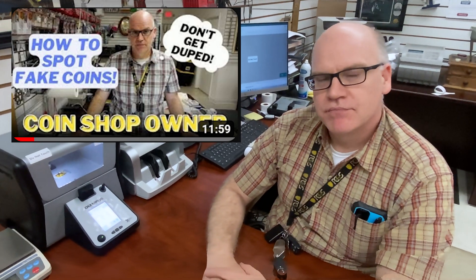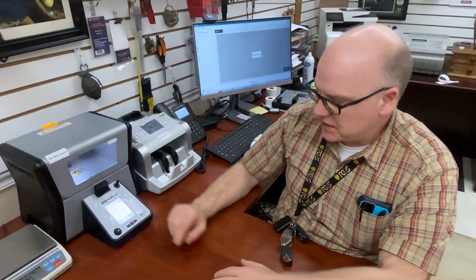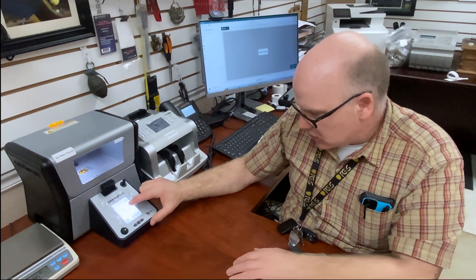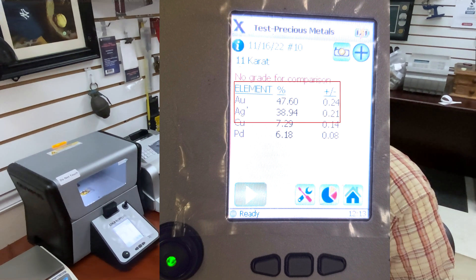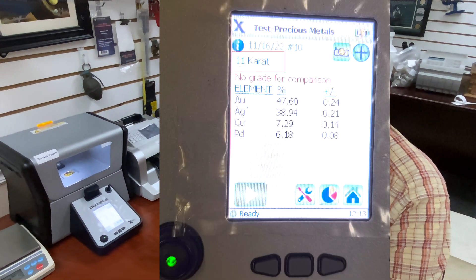Why do you need this when you already have the Sigma Metal Analytics that we went over in the last video, where Astro shows how to detect fake gold coins? Do you use this to test gold coins? We sometimes use this to also verify coin purity. The X-ray gives us an analysis of the composition of the metal — this tooth came back as 47% gold, 38% silver, copper, and palladium. The carat on this comes back as 11 carat, which is a little low for dental gold.